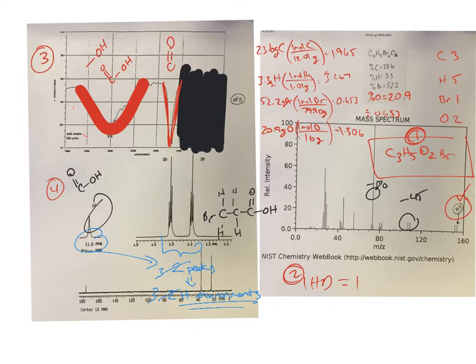From here, this is a small enough molecule that you could draw your different isomers and see which one would have 3 unique types of hydrogen, right? So we knew that. We can look over to that really, really high peak, and then it's useful to look at that chemical shift data, right?